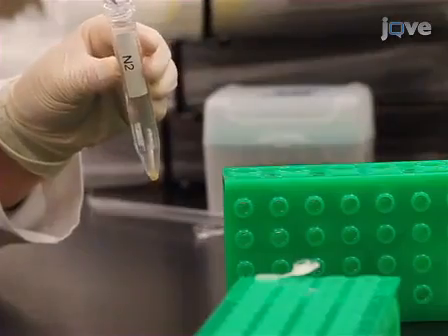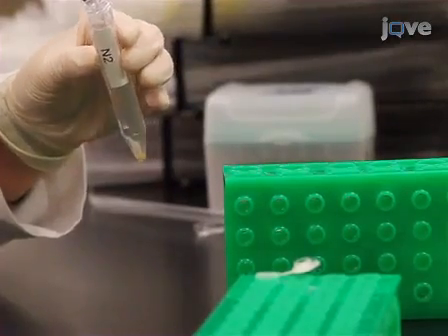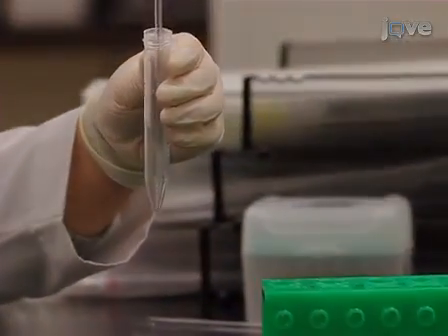The clean, loosely compacted pellet is transferred to a micro-centrifuge tube.